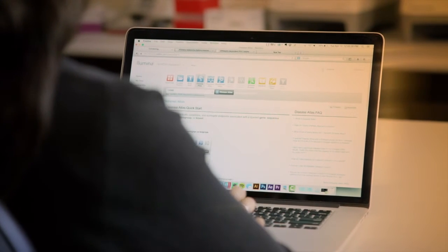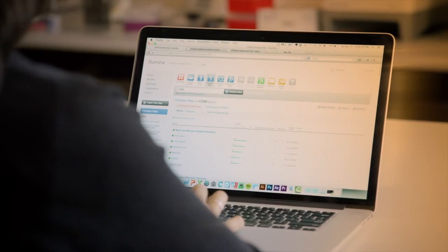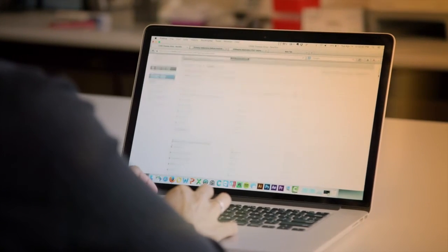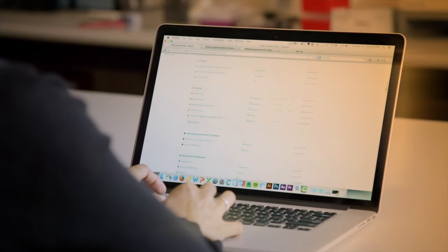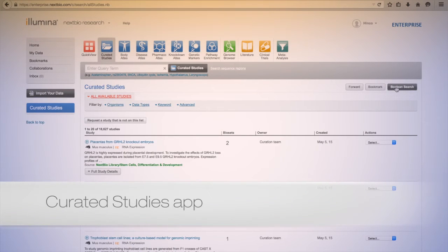See how your specific query connects with public genomic data around the world in seconds. Query all studies housed in the NextBio platform using the Curated Studies app.